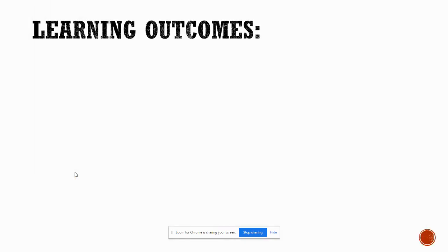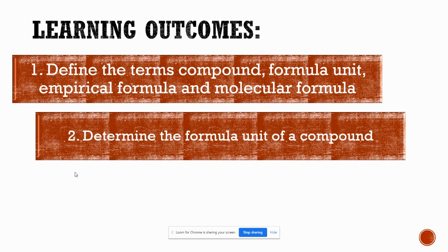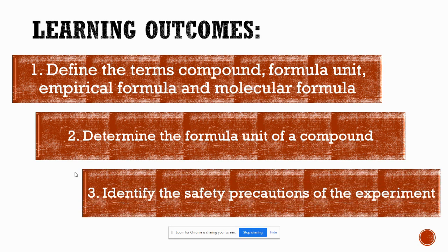Hopefully, at the end of this lesson, all of you can define the terms compound, formula unit, empirical formula, and molecular formula. Determine the formula unit of a compound. Identify the safety precautions of the experiment.